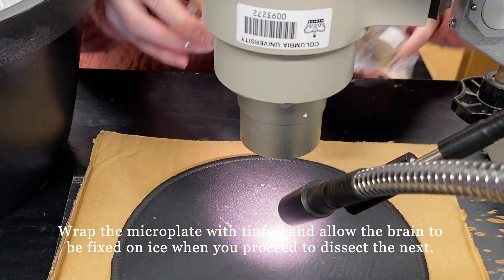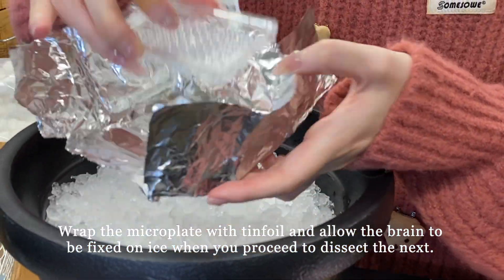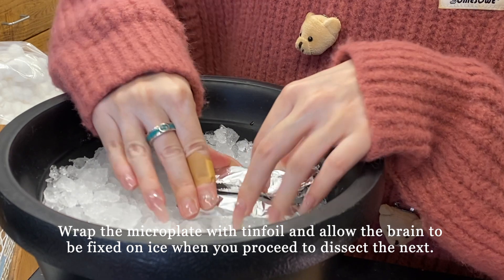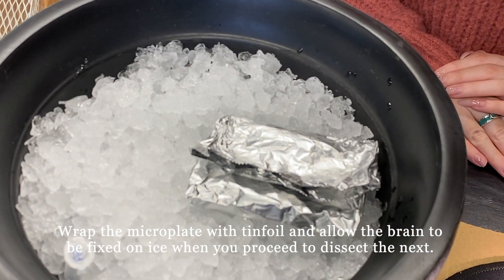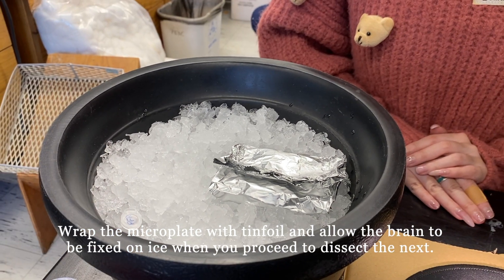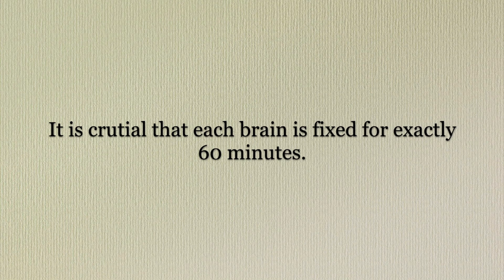Before we proceed to dissect the next brain, make sure to wrap the microplate with tin foil and allow the brain to be fixed on ice. It is crucial to make sure that each brain is fixed for exactly 60 minutes.